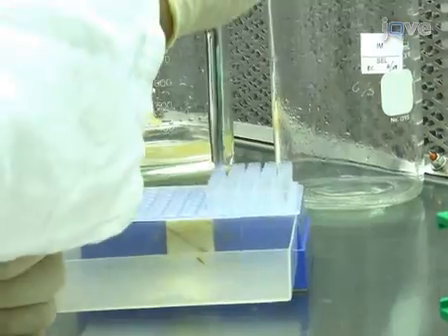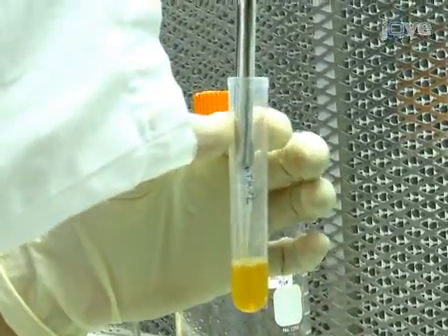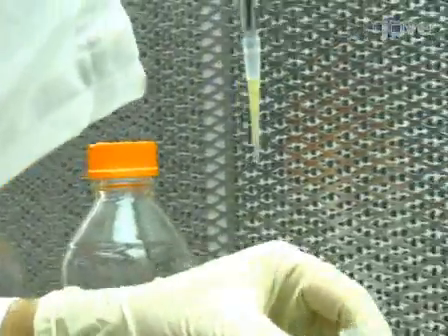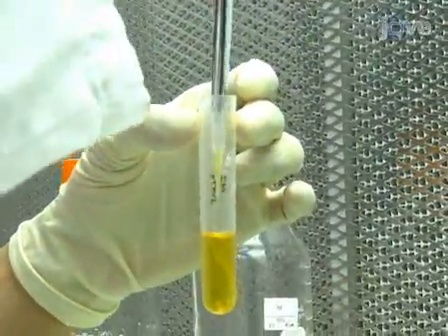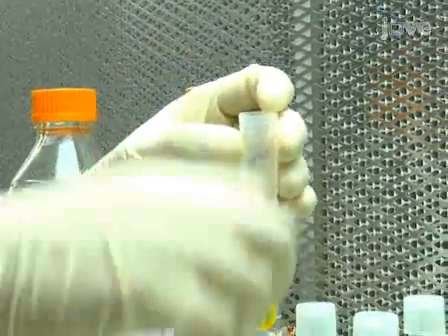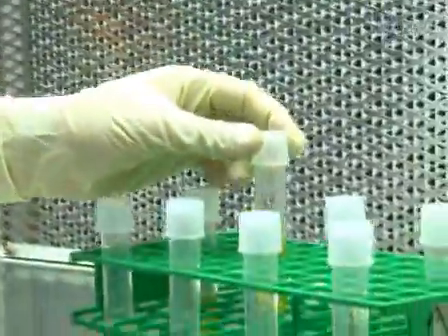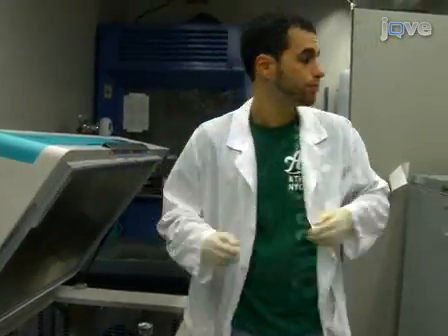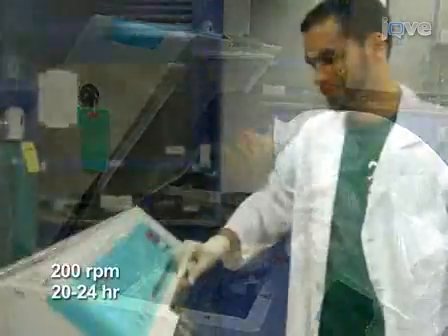On the following day, inoculate a 1 to 25 dilution of each primary culture into 5 milliliters of a secondary liquid induction media culture with kanamycin, rifampicin, and 200 micromolar acetylsyringone. The induction media mimics the environment that Agrobacterium encounters in the host apoplast, and the acetylsyringone induces the bacterial vir genes, which are required for T-DNA transfer into the plant.